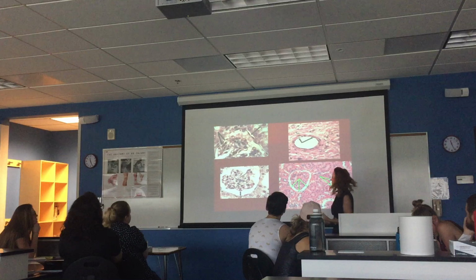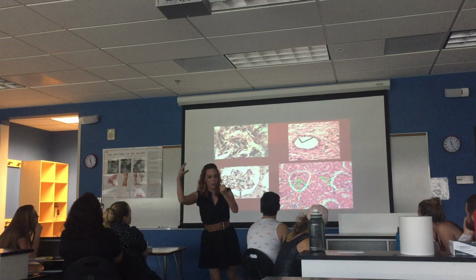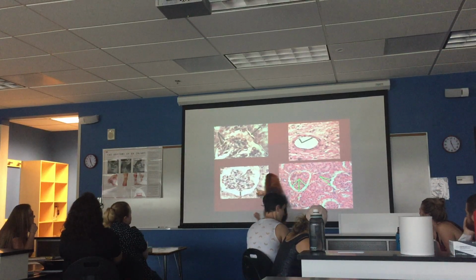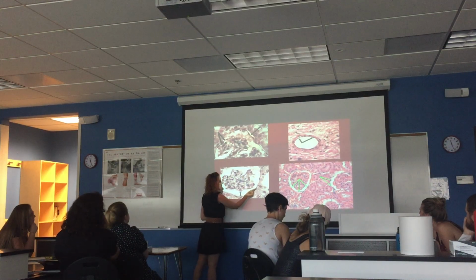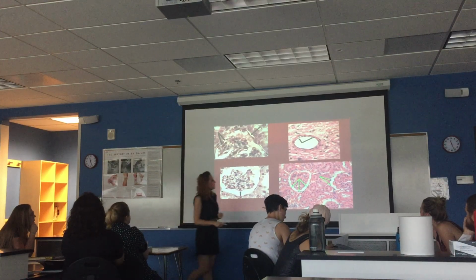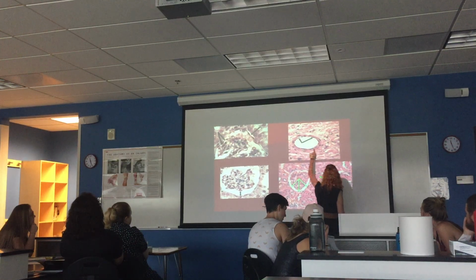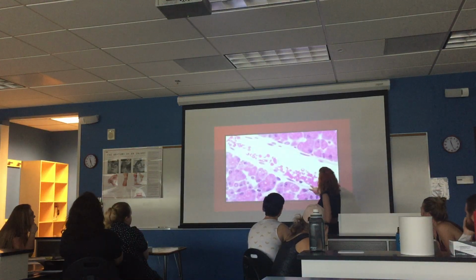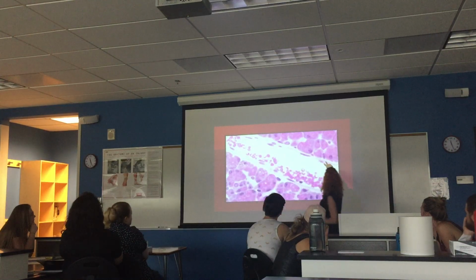So here's another example. This is a structure in the kidney called the glomerulus. It's a little bit like a baseball in a glove. That glove is your filtration membrane in your kidney, and these guys have simple squamous epithelial tissue lining the glove. You can see them here, here, here. This is a blood vessel. Here, here, here. Here's a blood vessel. Here, here, here.